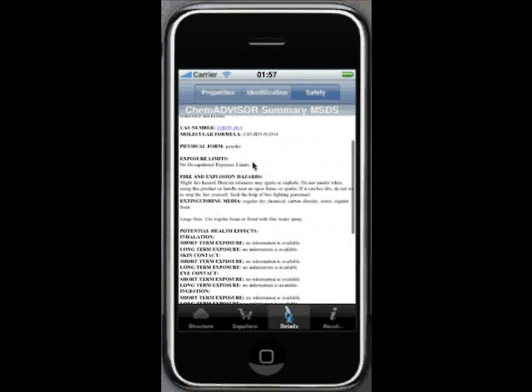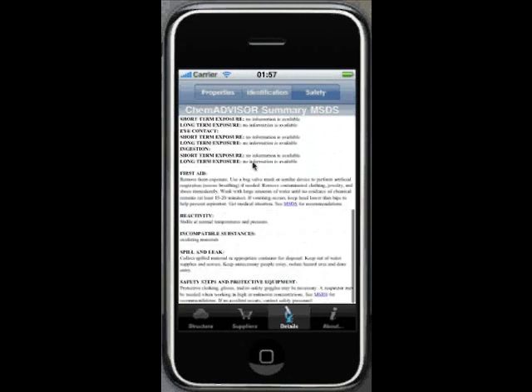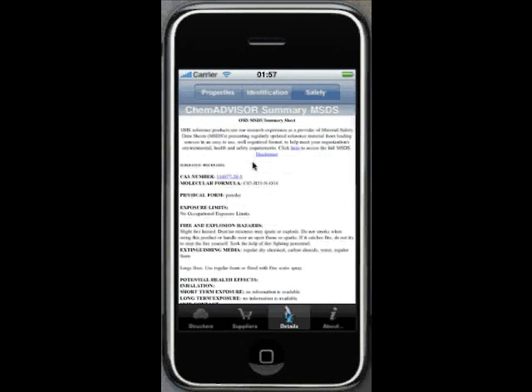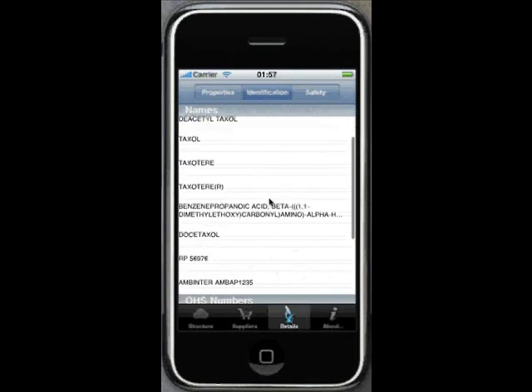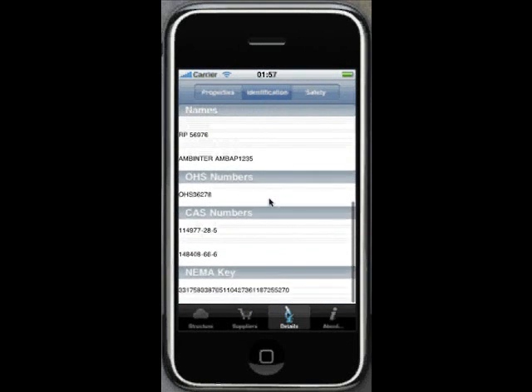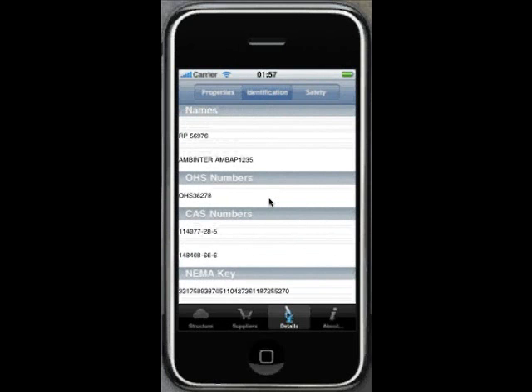The safety information comes from ChemAdvisor. This is a summary MSDS. Going back to the identification information, you can see we have CAS numbers here.